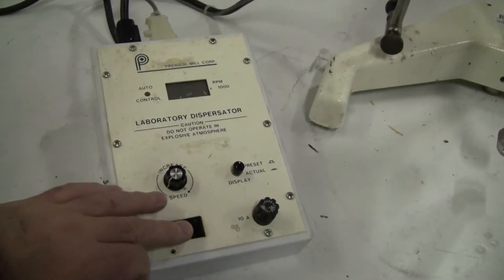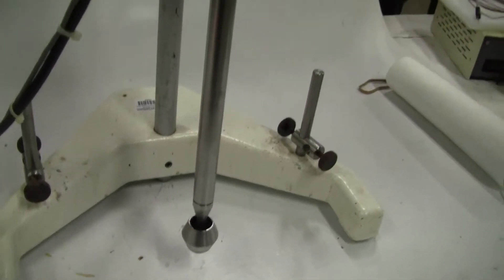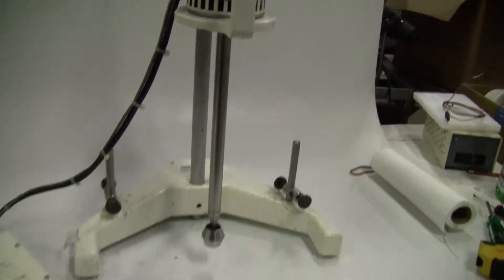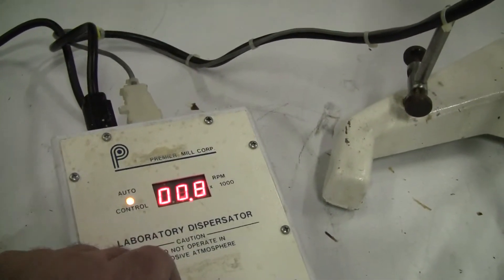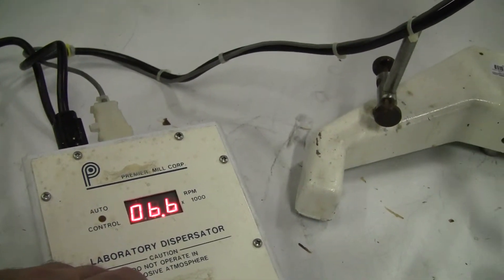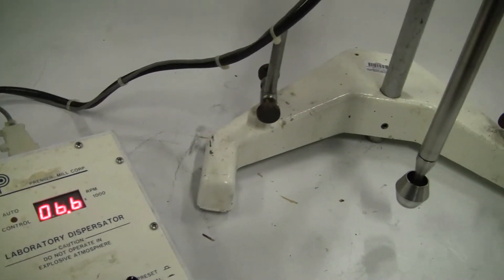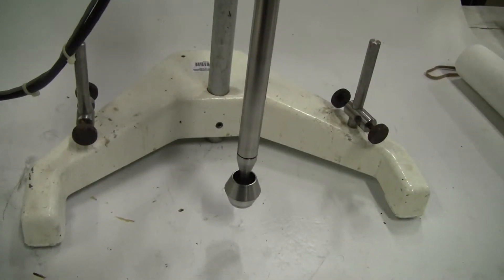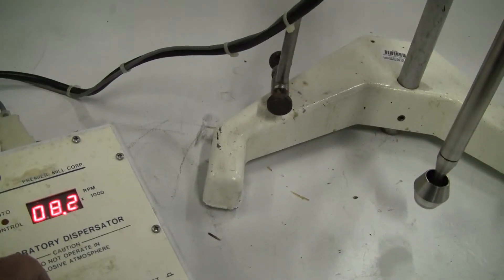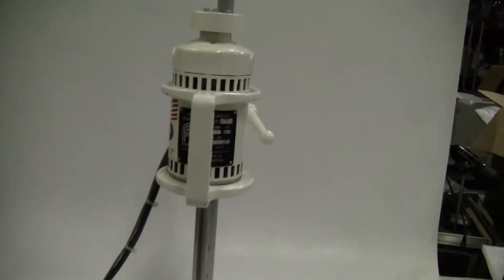Start her up. Let it get you to a display for the RPMs. Crank it up a little bit. There's 9,000 RPMs.